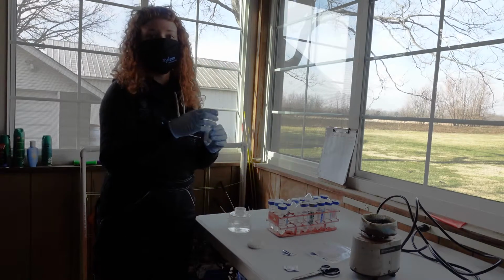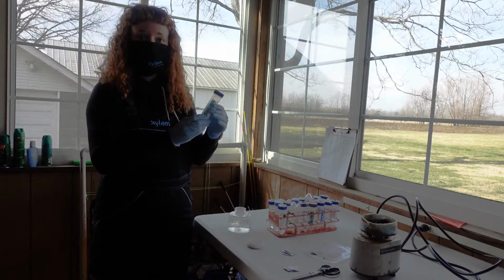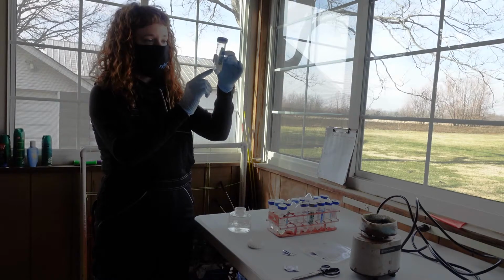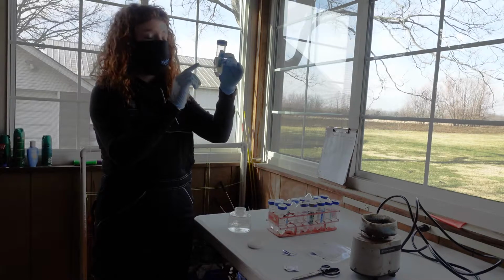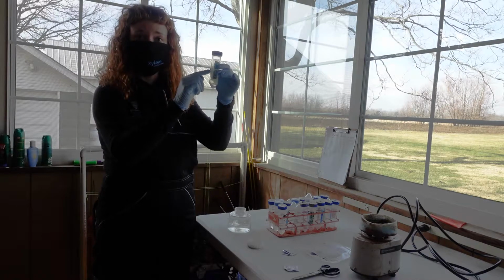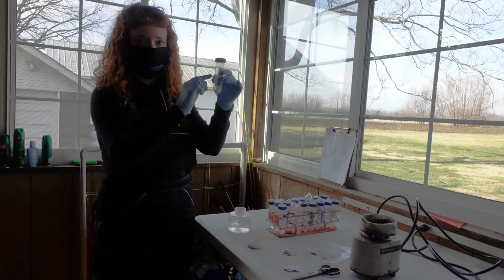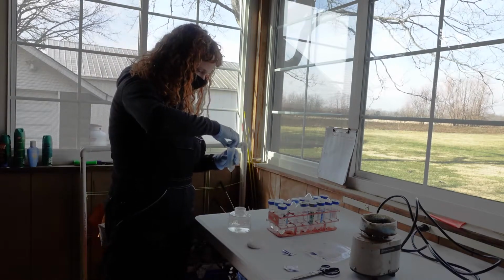All right, remember we have one last tube for number 1, our 1 spike. And remember, we had a couple milliliters of reagent already in here. What we will do is the same. We fill it to the mark 25. We don't add 25 milliliters. We fill it to the level at 25.